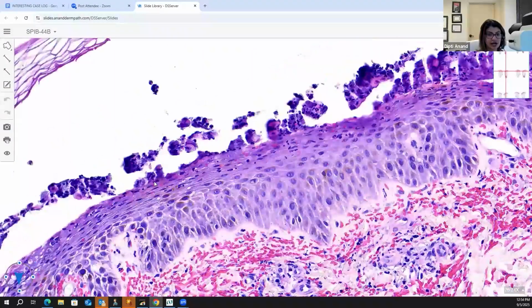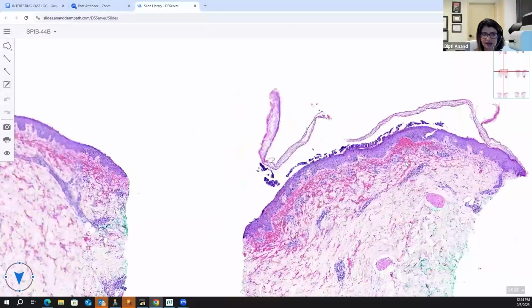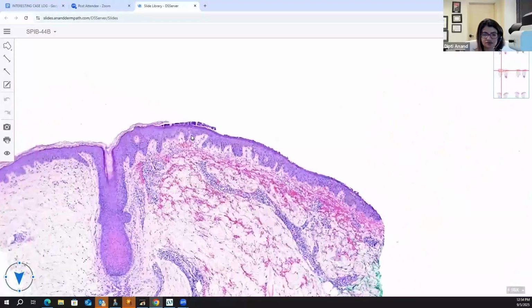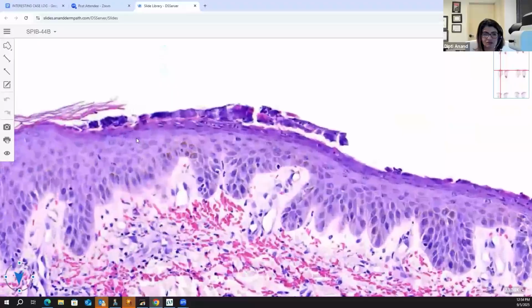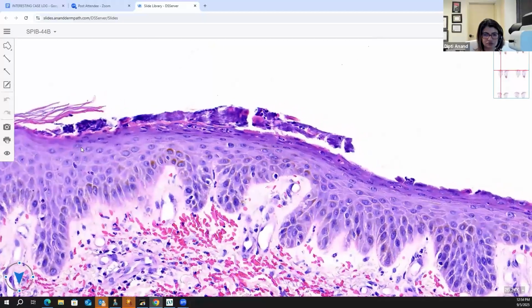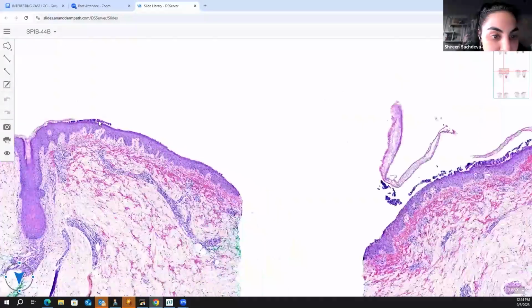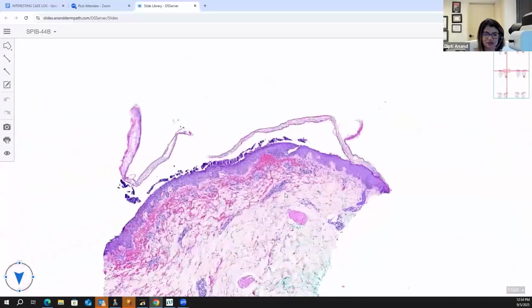You are correct. In this particular scenario, tell me, where do you see the bacterial colonies? Who else is seeing the bacterial colonies?